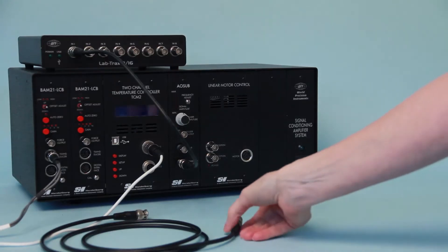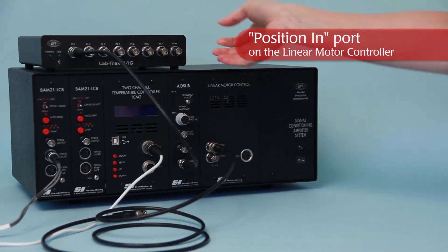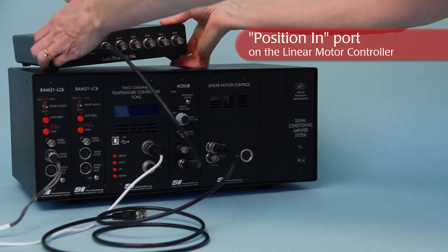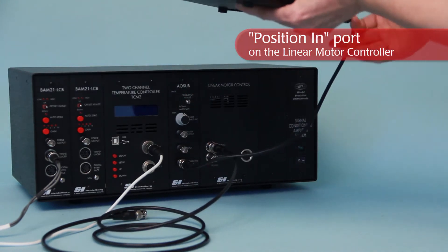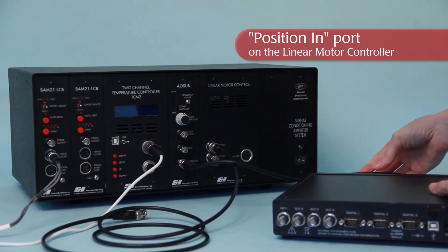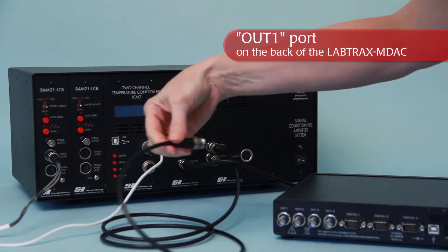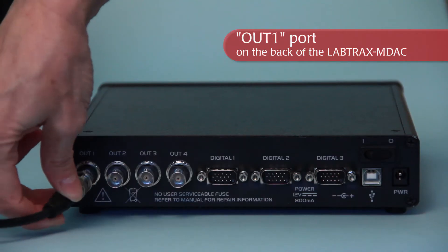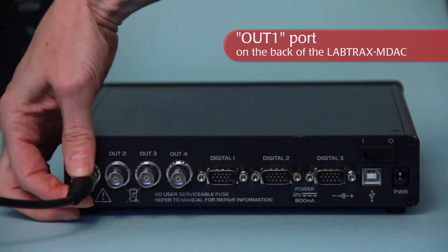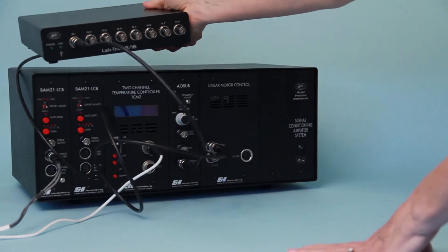If a motor is going to be used to stretch and relax muscles, it is controlled by an analog output of the data acquisition system. Connect a BNC cable to the socket on the front of the position control module labeled Position In. Connect the other end of this cable to the analog output on the data recording device designated for the position protocol, like the OUT1 connector on the back of the Labtrax MDAC.